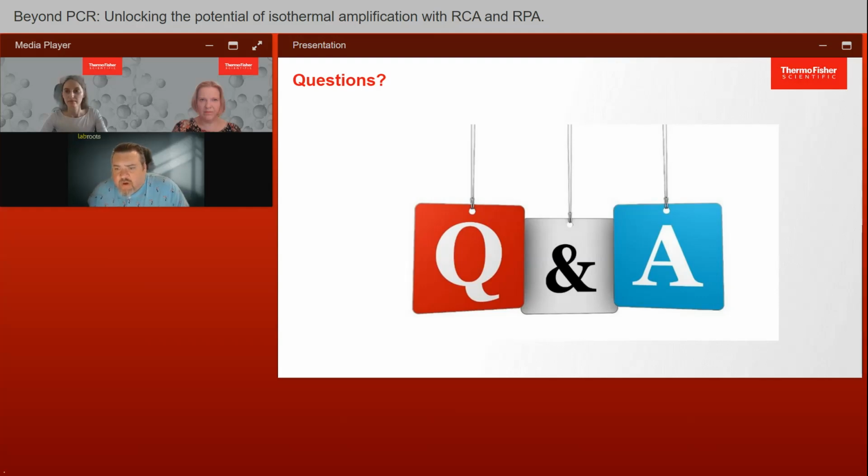Another one for you. In several cases during the webinar, it was mentioned that RCA products can be used directly for downstream applications. Are there any downstream processes that require RCA product purification or modifications?